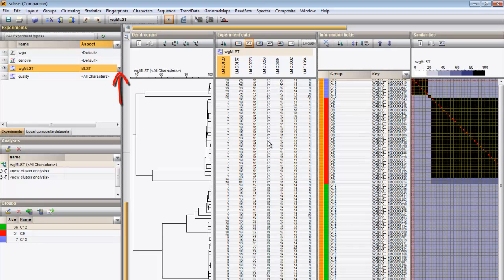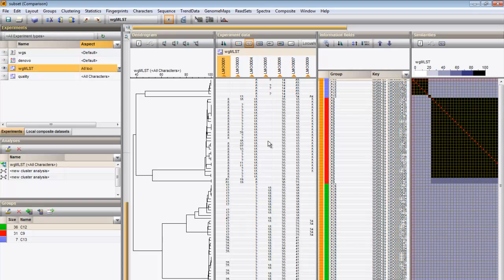Returning to all loci, I can again calculate a minimum spanning tree in the advanced clustering window.